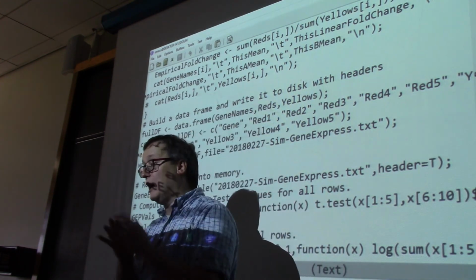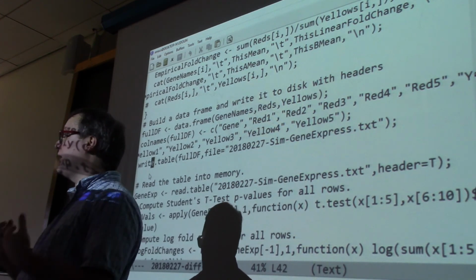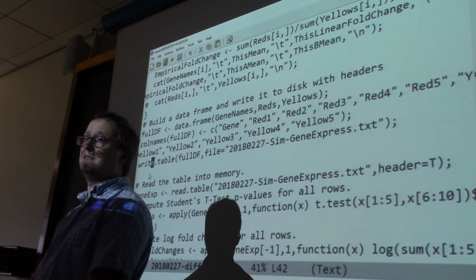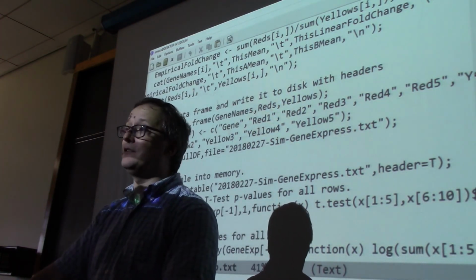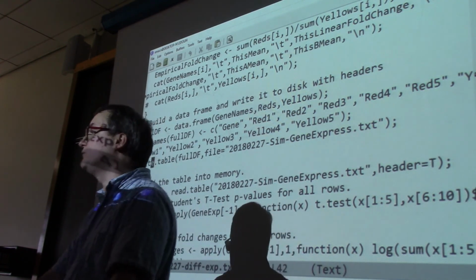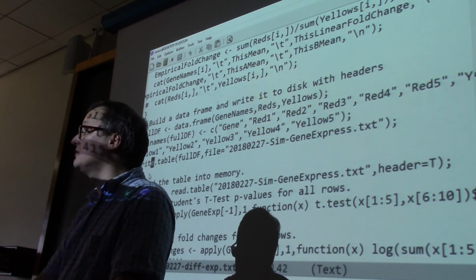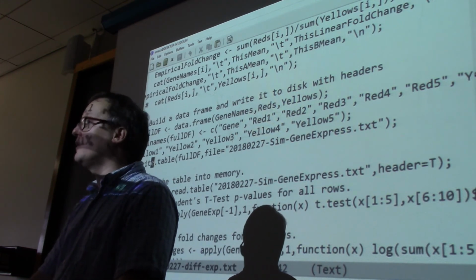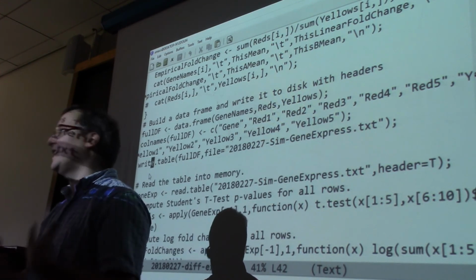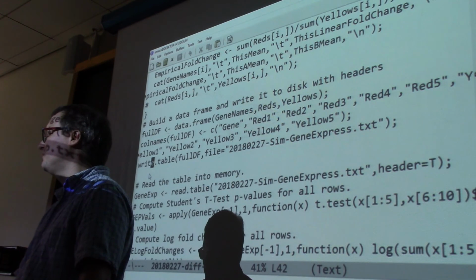So I hope this has been useful to you and that you've learned a lot about how R can help you do some more complex kinds of data analysis. And I want to point out that if R is not your cup of tea, if you find R just too daunting to work with, there are tools like GraphPad Prism, which can do things like this as well. So I hope that at the very least you feel a little better armed to understanding the kind of code bases that we typically use in biomedical research.